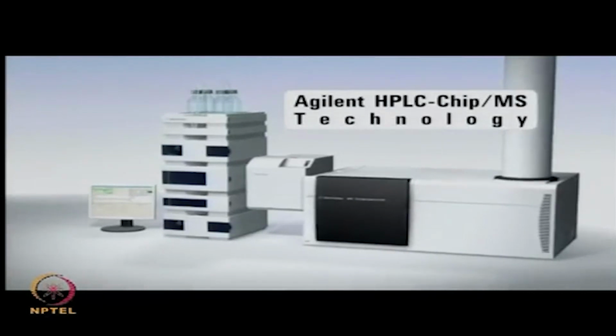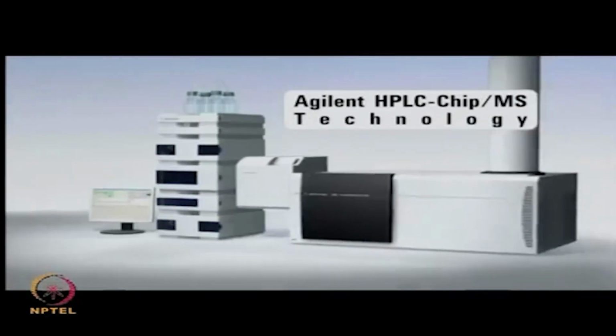HPLC chip MS, a growing trend in LC-MS technology. So it was very good to see the latest advancement in this field of mass spectrometry and what new technologies Agilent is offering. My final question to you is, what will be your advice to our students or users, and how would you like to conclude this session for mass spectrometry?